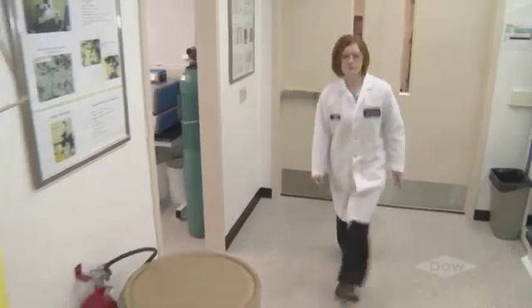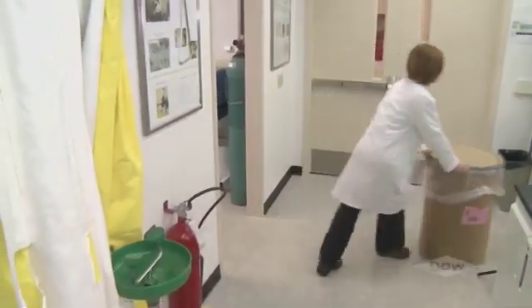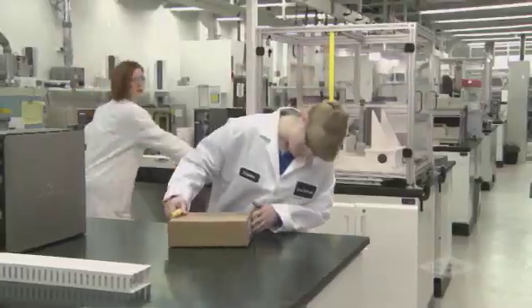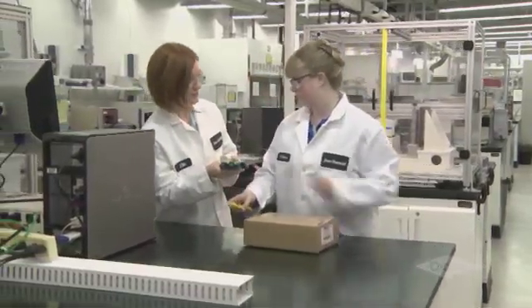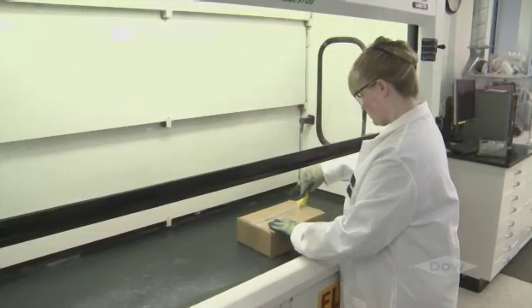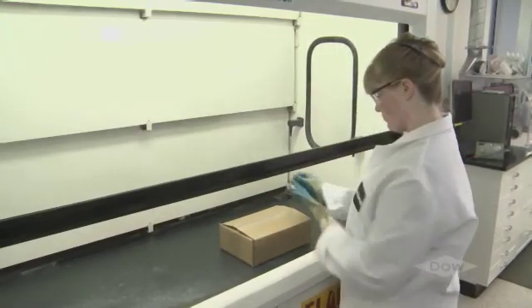For instance, have you ever seen safety equipment, maybe a fire extinguisher, that is blocked and unable to be used? Maybe you've seen a chemical container that's not labeled, or someone using their personal protective equipment incorrectly. Any slip, trip, or fall that happens injury-free is a near miss too. To help illustrate a common near-miss situation, let's see what Gail is doing in the lab right now.